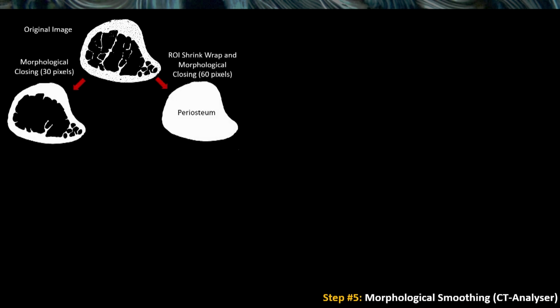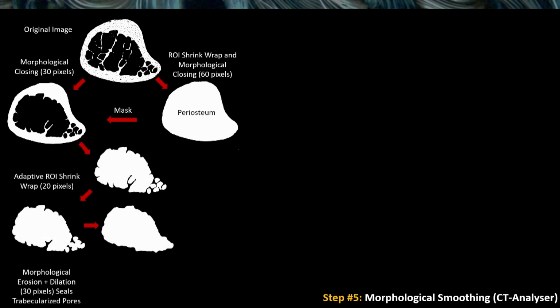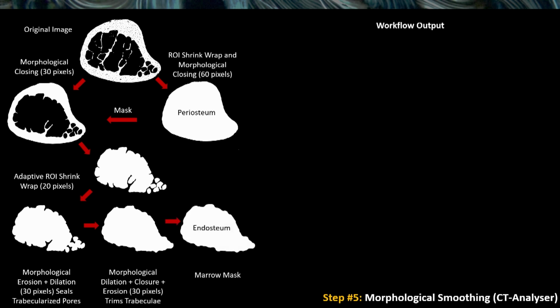And then finally, the way that I isolated the cortical bone from the trabecular bone was essentially by extracting the marrow cavity and smoothing it out a lot. And again, this isn't going to be as precise as deep learning because you run into that issue where you have holes very close to that cortical trabecular margin that look like the holes that are inside the cortical bone. And so that differentiation is a little less precise, but it does work pretty well for ribs and fairly well for femoral necks as well. And essentially this is just extracting the marrow cavity and smoothing it out consistently.